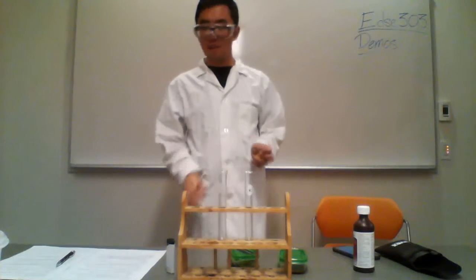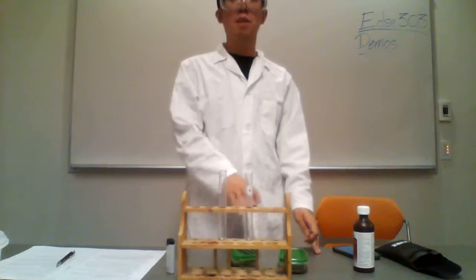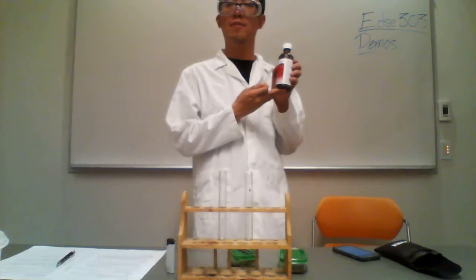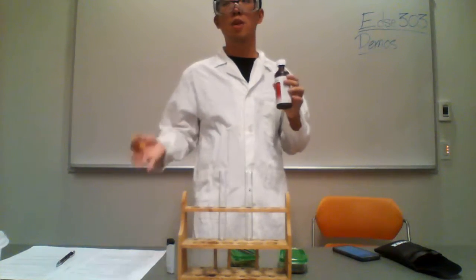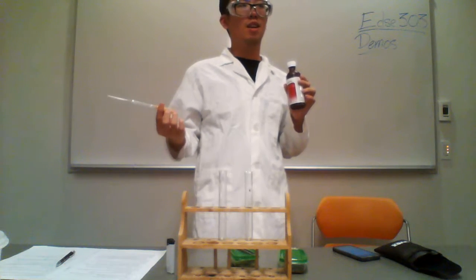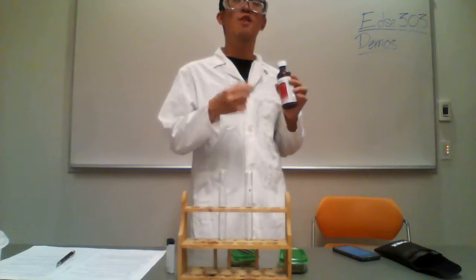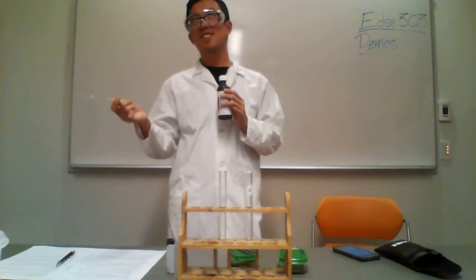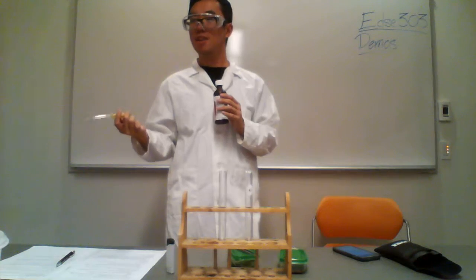Okay, so basically what is going to happen today is I'm going to take a piece of liver and a piece of potato and put it in some hydrogen peroxide. Do you guys have any guesses of what will happen when I do this? Is it going to make bubbles? You're correct. Why do you think it's going to make bubbles? Oxidation. Sort of. Yeah, you're pretty much on the ball there.